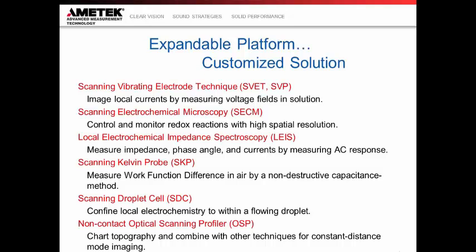Because we have potentiostats and because we can control both the sample and the probe at different polarized potentials in different cells. But some common ones are sensors, fundamental research, so electrochemical kinetics, this kind of work, and really any kind of mechanism investigation.